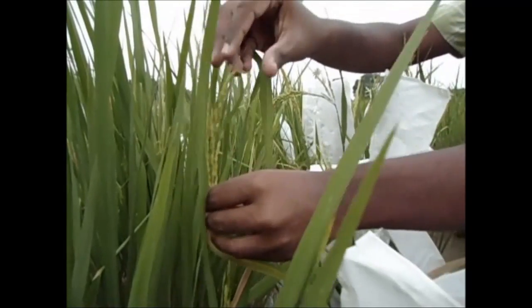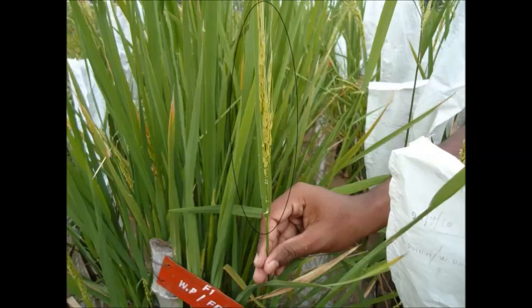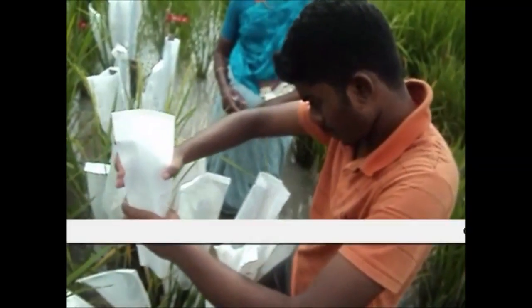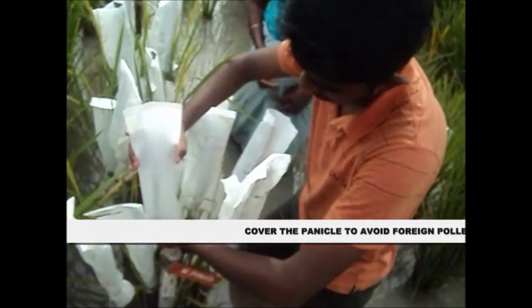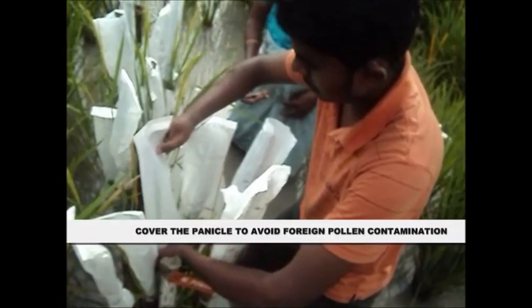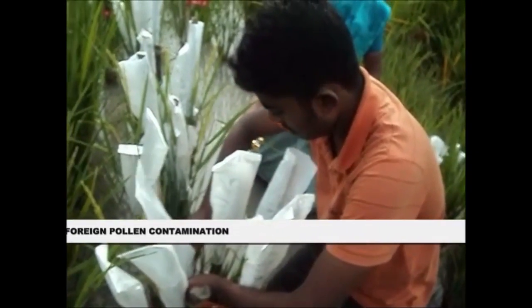Selfing. Selection of panicles for selfing. In the selfing of cross-pollinated species, it is essential that the flowers are bagged or otherwise protected to prevent natural cross-pollination. So, in order to avoid contamination from foreign pollen, the spikelets are covered with a butter paper bag.